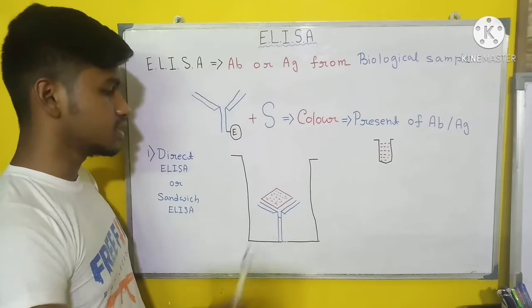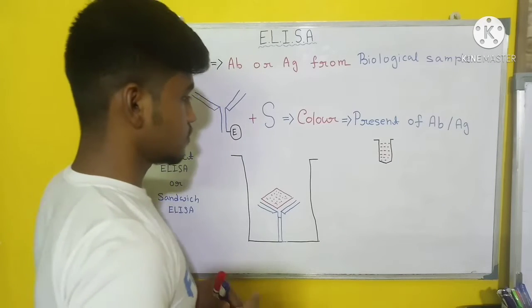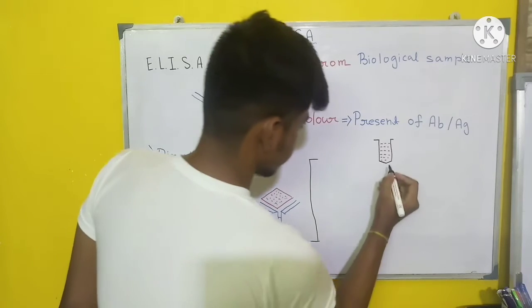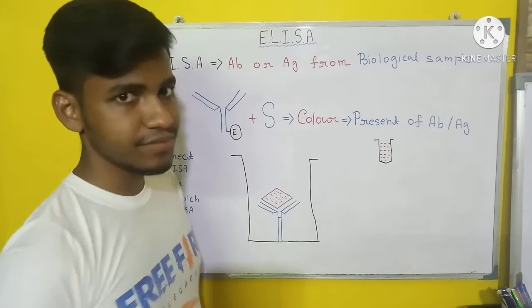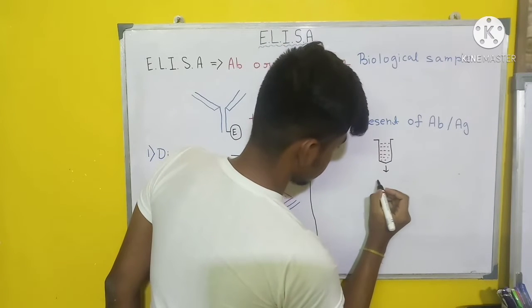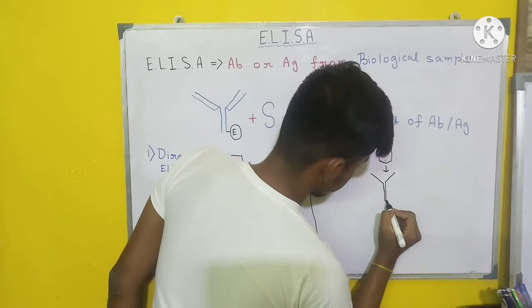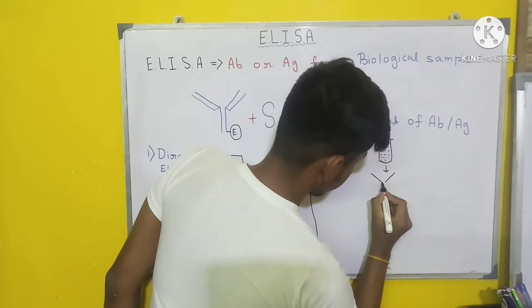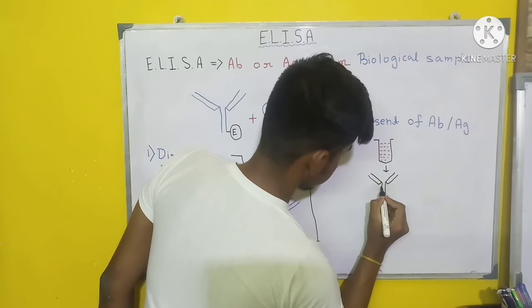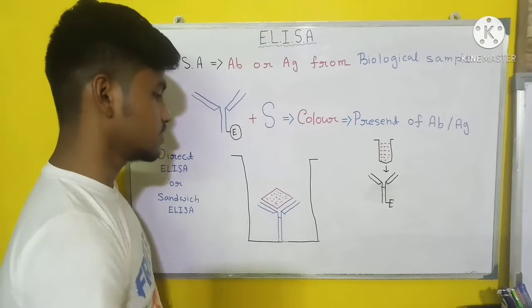After that, in the next step, we will attach our enzyme linked antibody in this well.